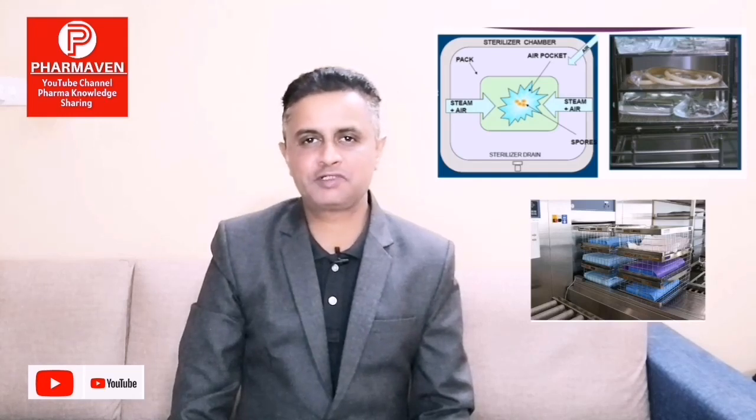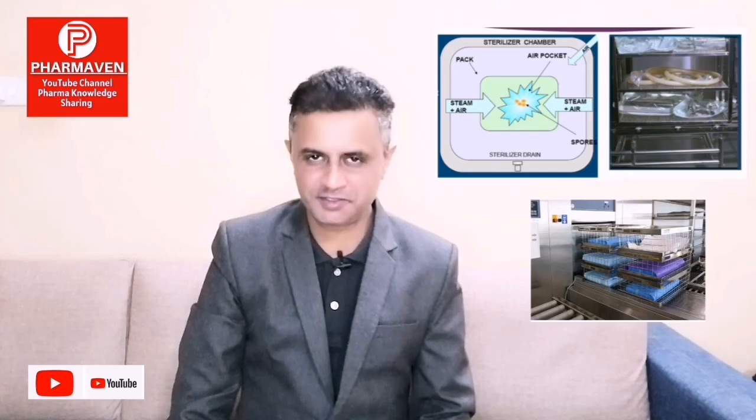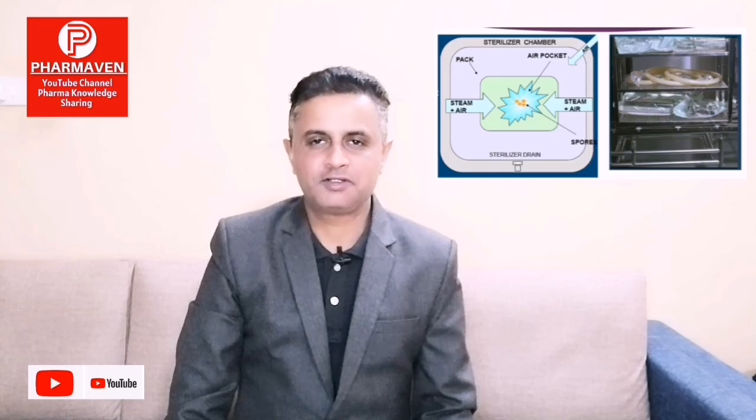The presence of air limits the capability of steam to penetrate and to transfer heat, the heat transfer coefficient. It depresses the temperature. When air is present in loads such as silicon tubing, long hoses, rubber stoppers, filter housings, gowns, such porous loads contain air and it is very difficult to remove. If air is not removed, steam cannot penetrate and we cannot achieve the required sterilization temperature, the required heat, at all the locations of the load.